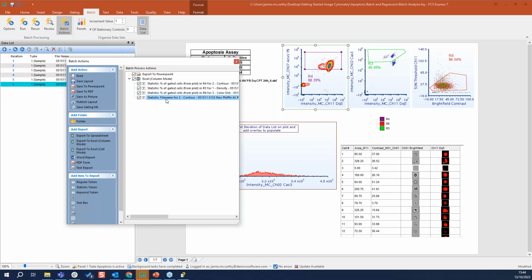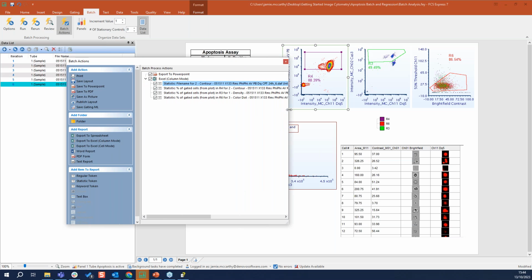At the moment, it would be the 4th column. Maybe you want it to be the 1st column, so you can just reorder things. What you can't do is directly drag and drop up. You can see that little no sign. You shift to the left, see this blue line, and then you can reorder things.